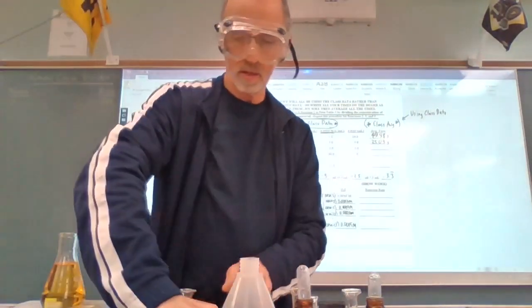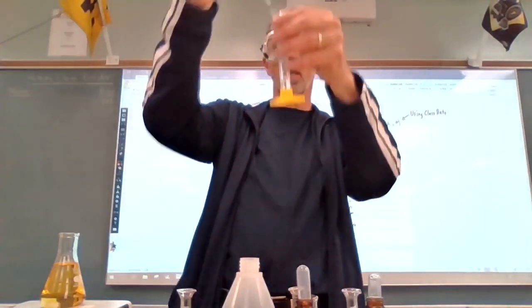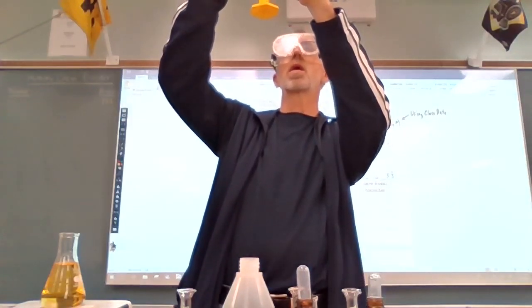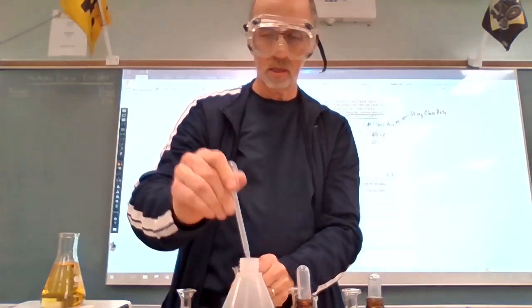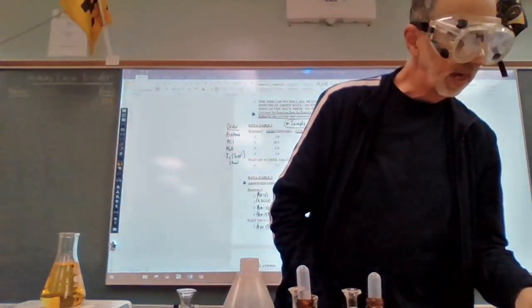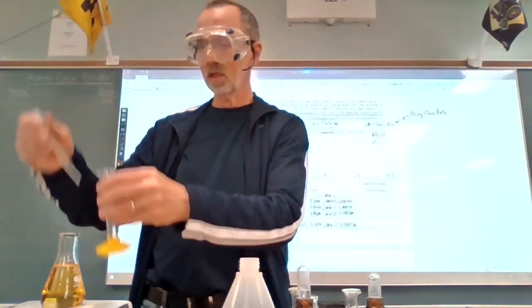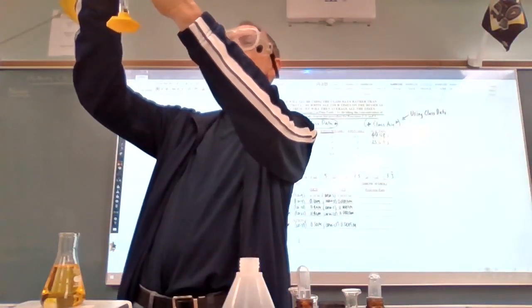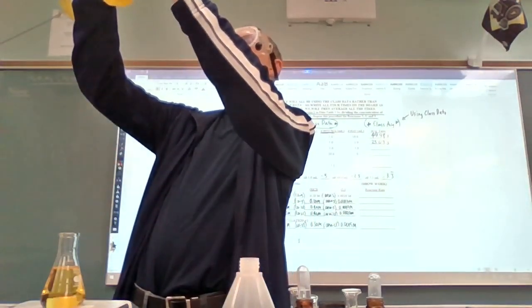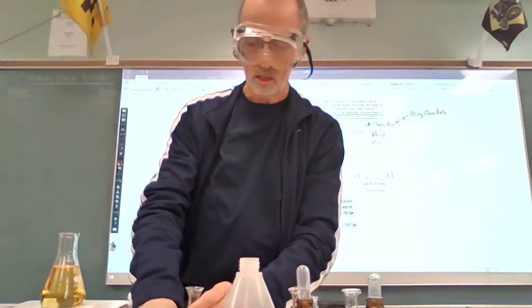5 water. And this time the iodine is again 5. All right.